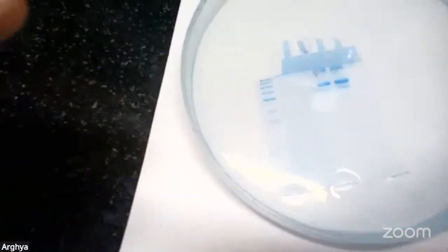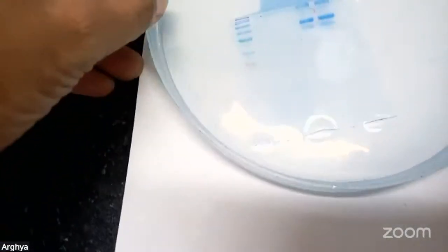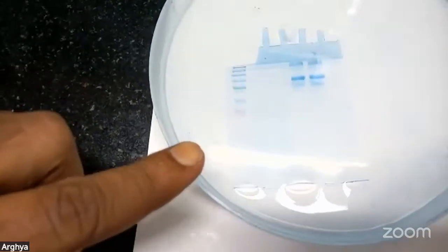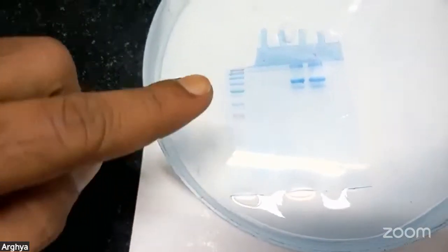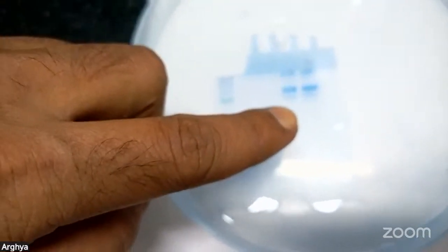I am exposing it without gloves, but always wear gloves, because this is one of the run gels. You can find the molecular weights which have been aligned, and you can decode the molecular weight with standard markers. These are my known samples, and this is how the prominent gel band patterns look like.